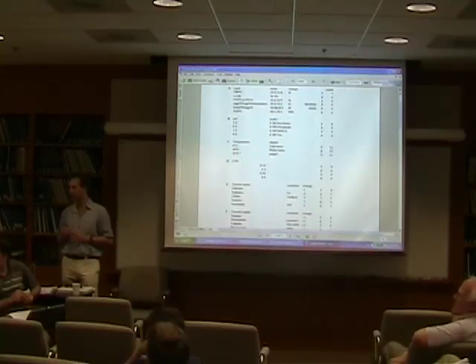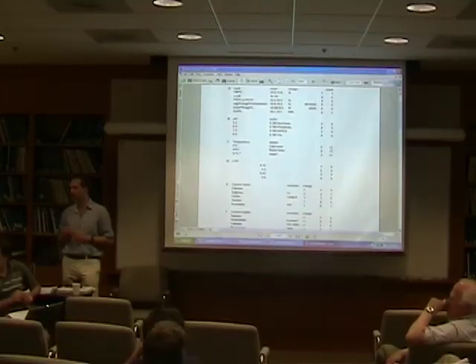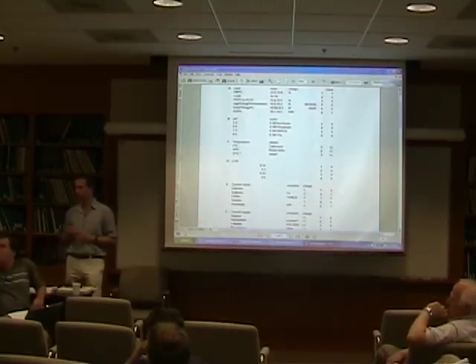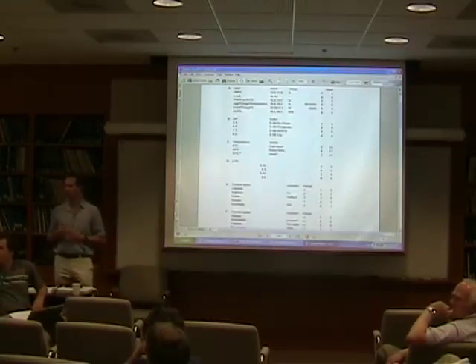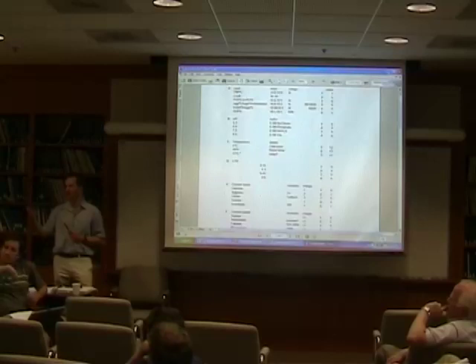For that, I still think you need to do dialysis, but if you can translate the conditions that you find in biobeads to dialysis, then the biobeads is not so useful if you want to go to really high resolution. Is there any evidence to suggest that's not the case? I just don't know. I would have thought it should be a logic of doing one and then the other.